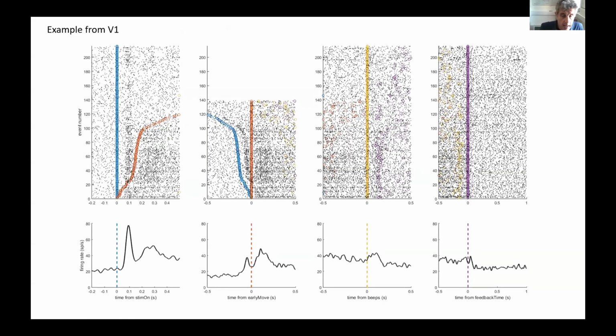So here's some data from one of the early Neuropixels recordings made by Nick Steinmetz, when mice were doing a behavioral task with Neuropixels electrodes implanted. The task was the mice were sitting in front of some video screens. A video stimulus came on. Then they had to turn a wheel. And if they turned it in the correct direction, they would get a reward. And then they would lick the reward. And what we're looking at here is an example neuron from V1, raster plot.